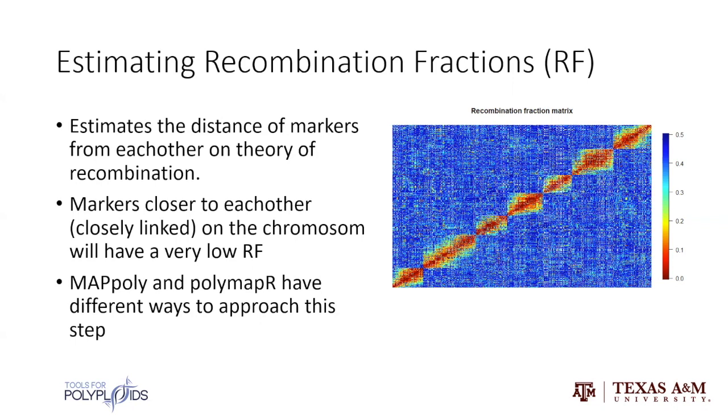From that step, you make your seven chromosomes, or however many chromosomes, then your homologs from those chromosomes, and make a scaffold, and then fit all the other marker types to that. The pro of this strategy is that computationally, you reduce the number of recombination fraction calculations you have to make.